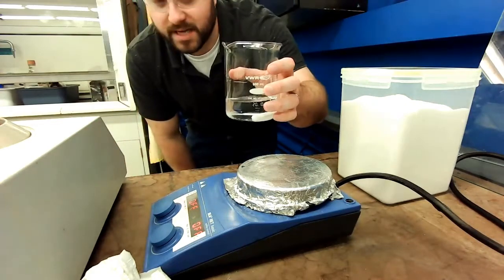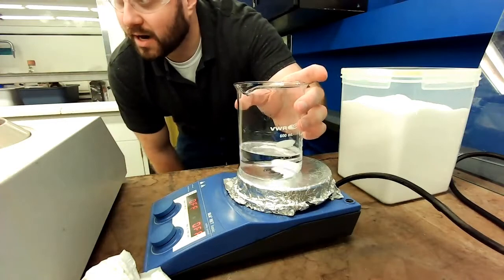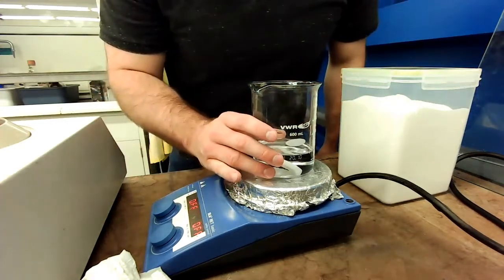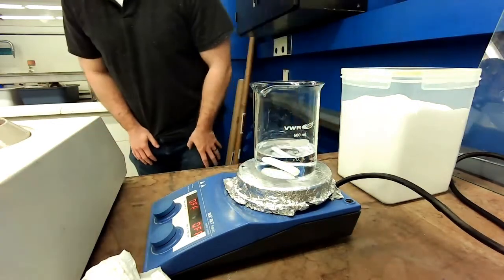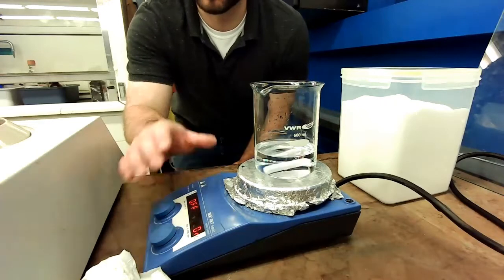Now what I can do is I'm going to take this thing and that magnetic stir bar is going to be attracted to the magnet in this plate. So I'm going to want to look at this, make sure that it's relatively centered, and then I want to turn on that stir bar, okay?